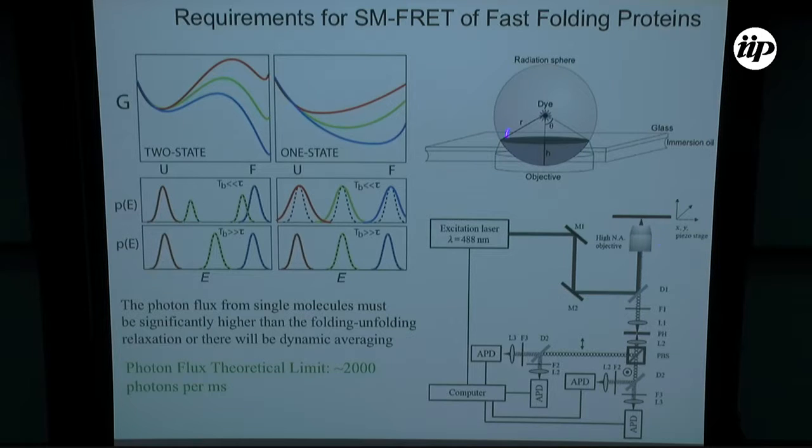And then obviously, on top of this, you have this bunch of lenses and filters and so on. Each one has losses. Then the detectors have some sensitivity, which is not wonderful, and so on and so forth. At the end of the day, when you put all these factors together, your collection efficiency is on the order of 2%, which means it's a crappy instrument in a way. But of course, you're trying to do something really difficult, all right? So out of 1 photon every 5 nanoseconds, you're only going to collect 2% of those. And that's where these numbers come from; maybe you're lucky, maybe 3 or 4%. You're playing with the optics and with the mirrors and with the alignment and with all these different things, okay?